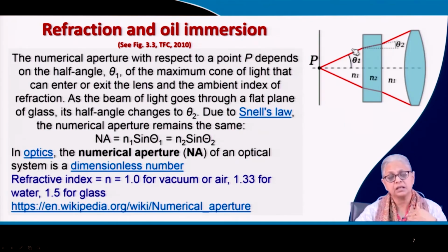So if it reflects a color, then I can identify it. Either it absorbs light or it reflects light, then I can identify an object. If it passes right through, I cannot, and that's what happens with bacteria, because they're practically water. So it passes right through, and if you don't stain the bacteria, you can't see them. So that's one issue. Now let's take a look at more.